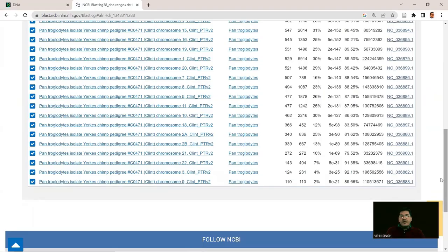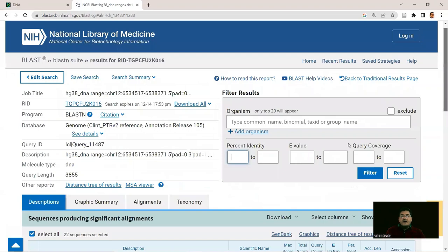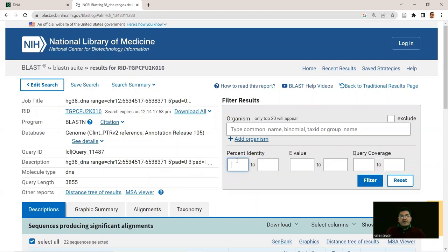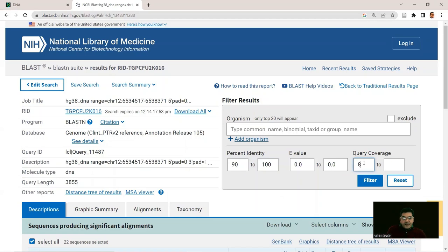You can filter results by setting minimum/maximum percentage identity, E-value, and query coverage — for example, 90–100% identity, E-value 0.0, and 80–100% query coverage. Applying these filters reduces the list to a single hit, which is the main orthologous match. Resetting the filters shows the full result list again.